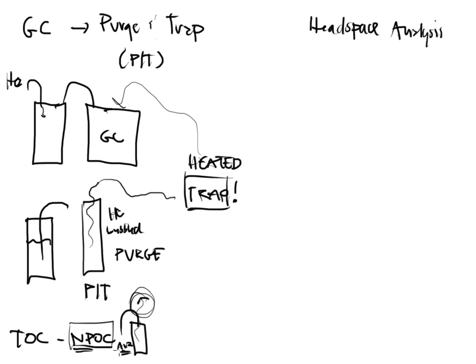All right, and that's all there is to it. That's the only purpose in it. It's mainly used for environmental, and that's where we're going to find this most of the time. The environmental aspect of the Purge and Trap systems, those are very volatile as far as the types of compounds that we're looking for. They are very well suited for this type of analysis, and it allows me to basically separate the components that I want to measure from the aqueous sample.